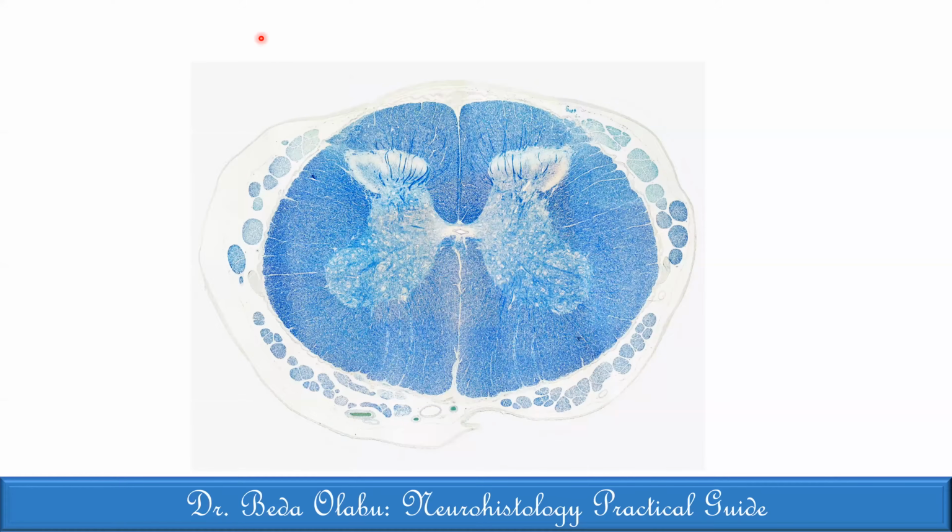I can see here that we have a relatively equal amount of white matter to gray matter. But what is remarkable is the predominant amounts of collaterals from on the sides. And also, I cannot clearly distinguish the division of the dorsal columns.